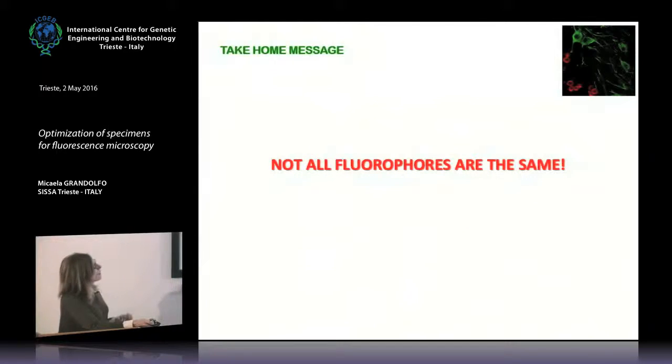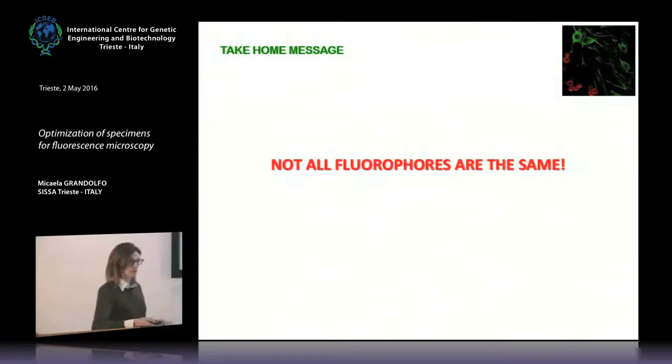Okay, so I hope I have convinced you that not all fluorophores are the same, and it is really useful to spend some time to decide which fluorophore you want to use for your particular experiment, and not just use what you have in your fridge, okay, in the lab fridge.